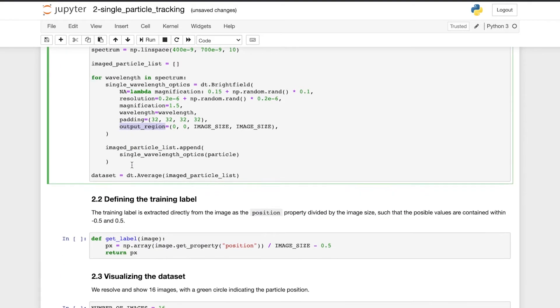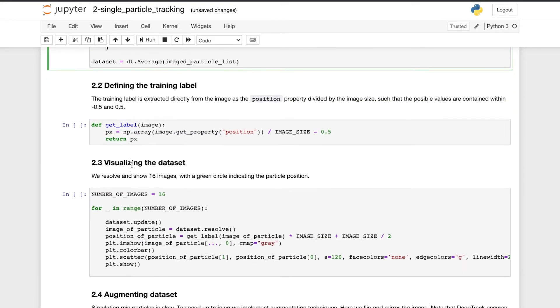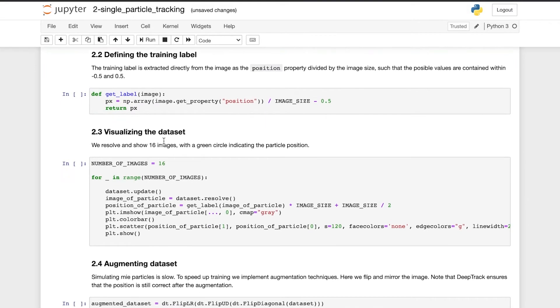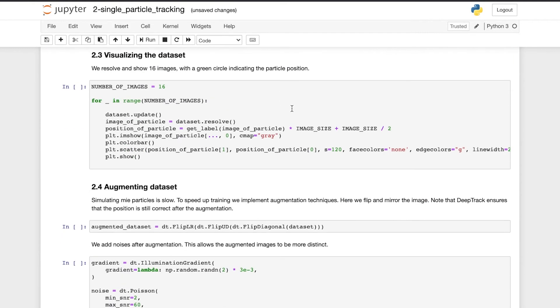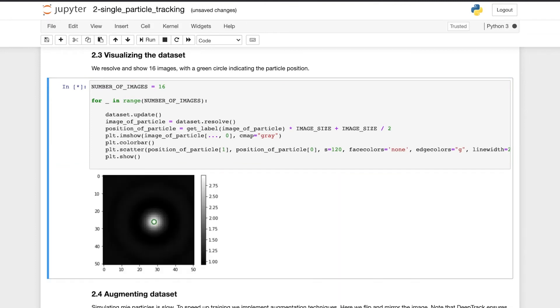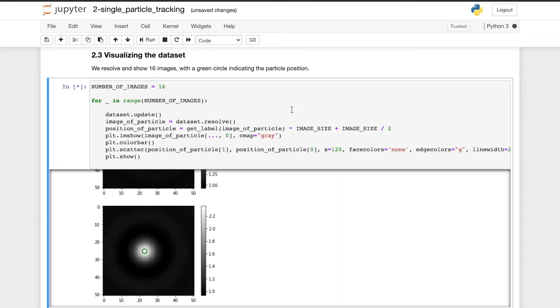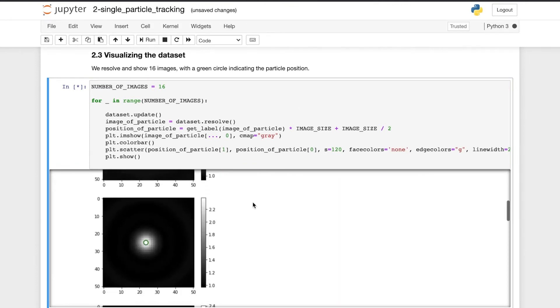We then define the training labels as the particle position by extracting the position property from the images. And we divide the position by the image size such that the possible values are contained between minus 0.5 and 0.5. And now it's time to visualize the training images, where the green circle indicates the particle position.